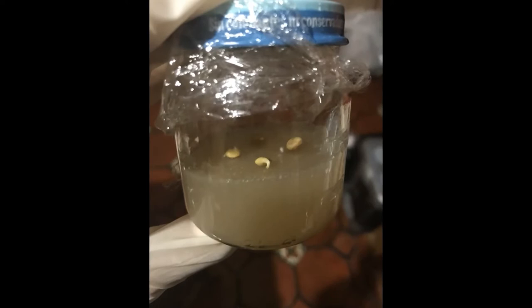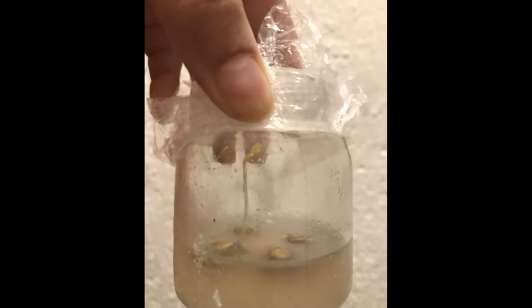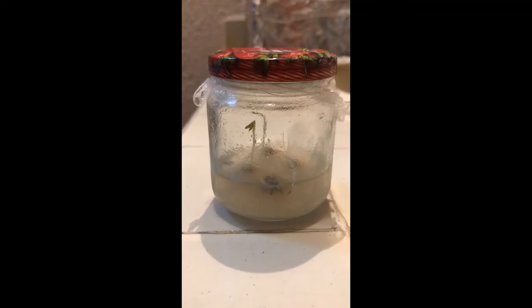After one day, the first germination starts to be visible. After 2 days, the germination was clear, but also there was a probability of fungi activity. After 3 days, almost half of the lentils germinated, but unfortunately, fungi activity appeared, and although I tried to take it away, the fungi didn't stop.